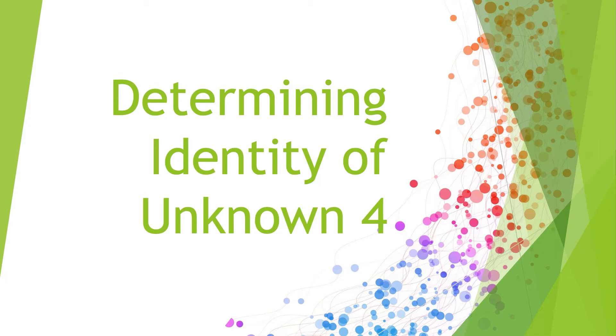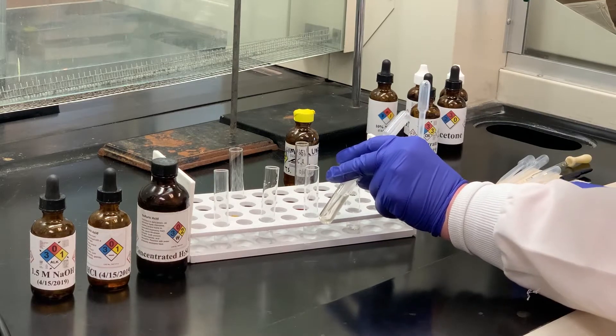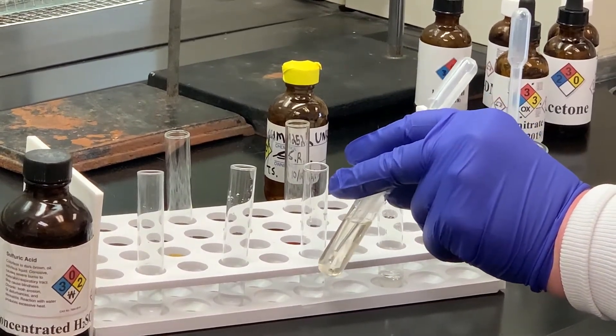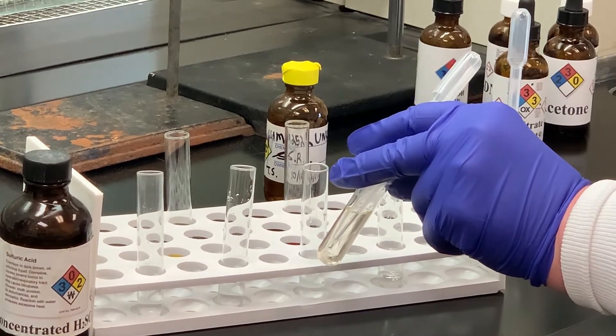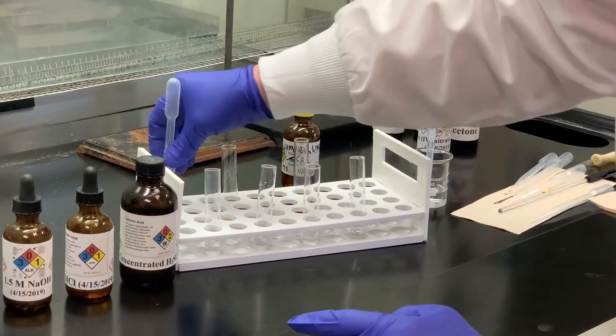Our next unknown is unknown number four. You can kind of tell there's a little bit of a tint to that substance. Make observations in terms of physical state, and I've got that in a clean test tube.